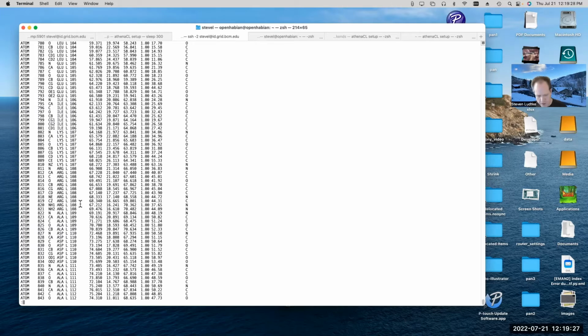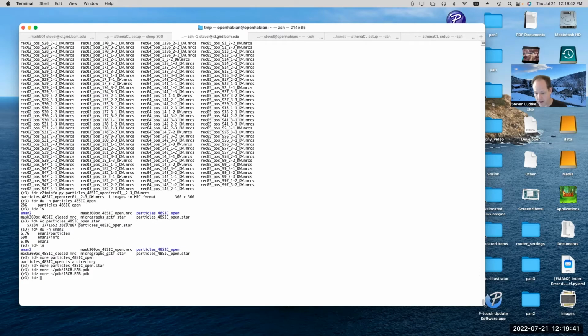Now, the programmers who dealt with PDB files were very resistant to change, and it took on the order of 20 years to get the X-ray crystallography community to finally shift to the new file format. And the new file format is basically in star format. They call it something else, but it's basically star format.